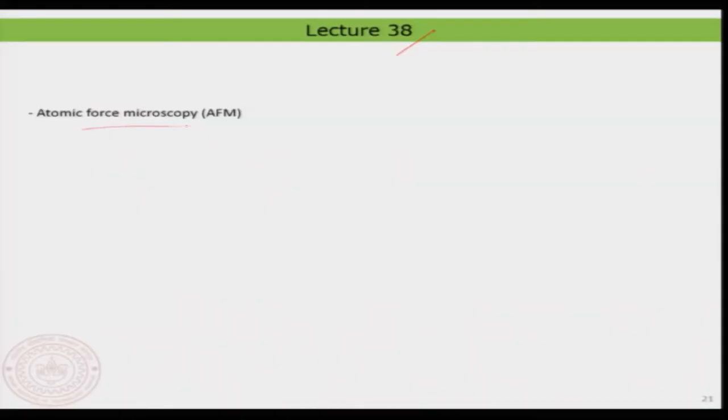Hello everyone, welcome back to lecture number 38. In this lecture we will continue with atomic force microscopy. We'll try to see a few more applications of atomic force microscopy.